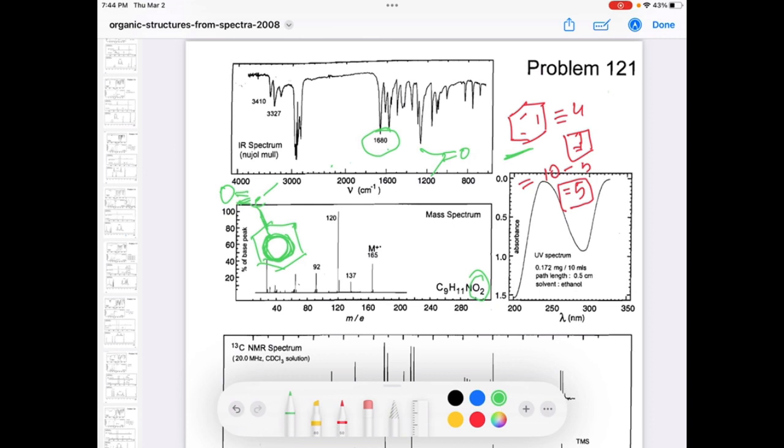There are some other things also. If you have a carbonyl peak along with NH2, that is called amide. In this amide case also, the carbonyl peak always comes lower than 1700, around 1690, 1680, something like this. So we're not going there.